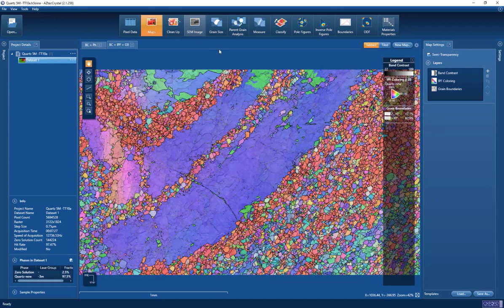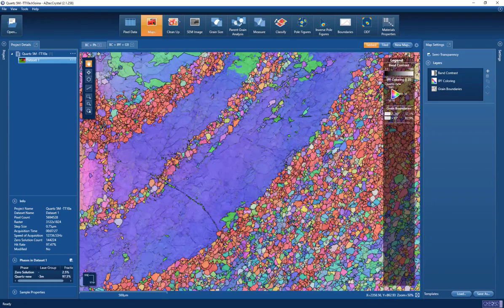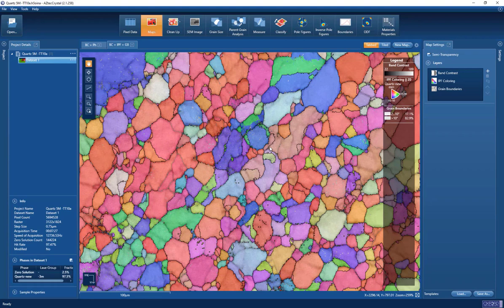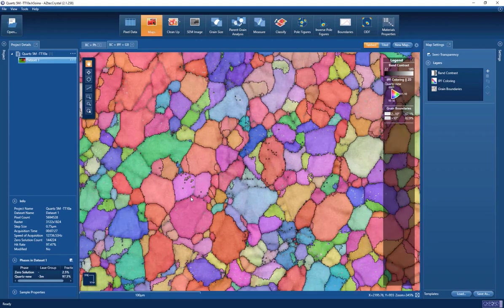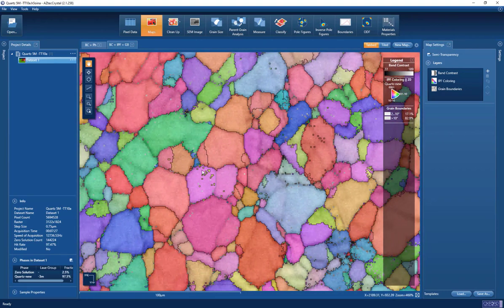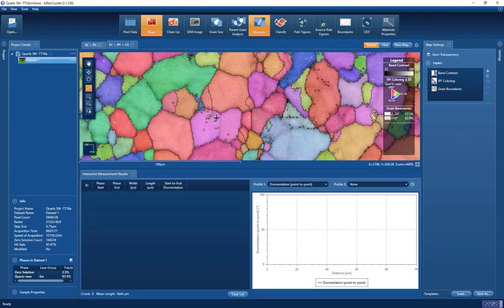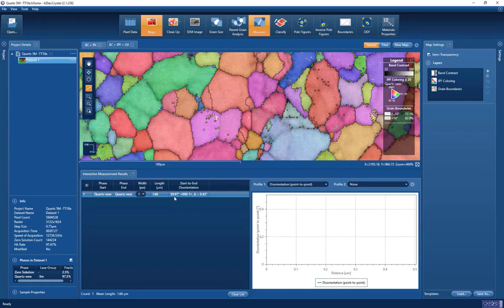I'll show quickly later on how we can correct a distorted data set. We need to look at the quality of the indexing — something you should always undertake with EBSD data. There will invariably be points that haven't been indexed, often along grain boundaries or where there's dirt. But there will also be small clusters of points with the wrong orientation. In this pink/purple colored grain we can see little points with a specific relationship to the host grain — 60 degrees around the C axis — and this is what we call the pseudo-symmetric indexing error.